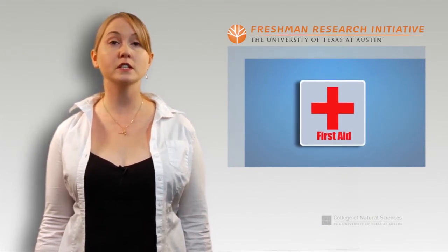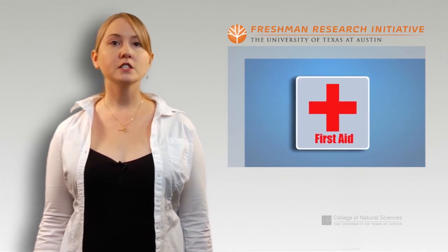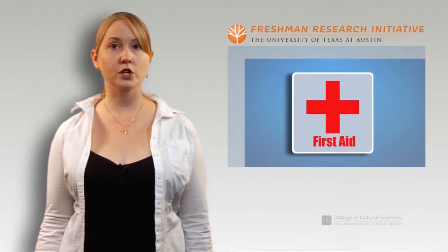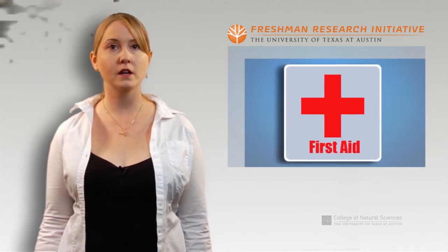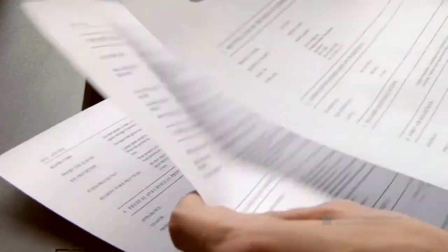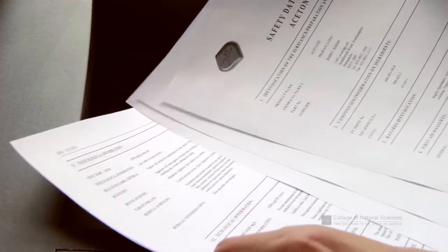If someone is exposed to a chemical or hazardous biological substance, they should go to the nearest hospital. Depending on the severity of the exposure, EMS may need to be contacted to transport the person. Print a copy of the SDS for the person to take to the hospital with them if it is a chemical exposure.